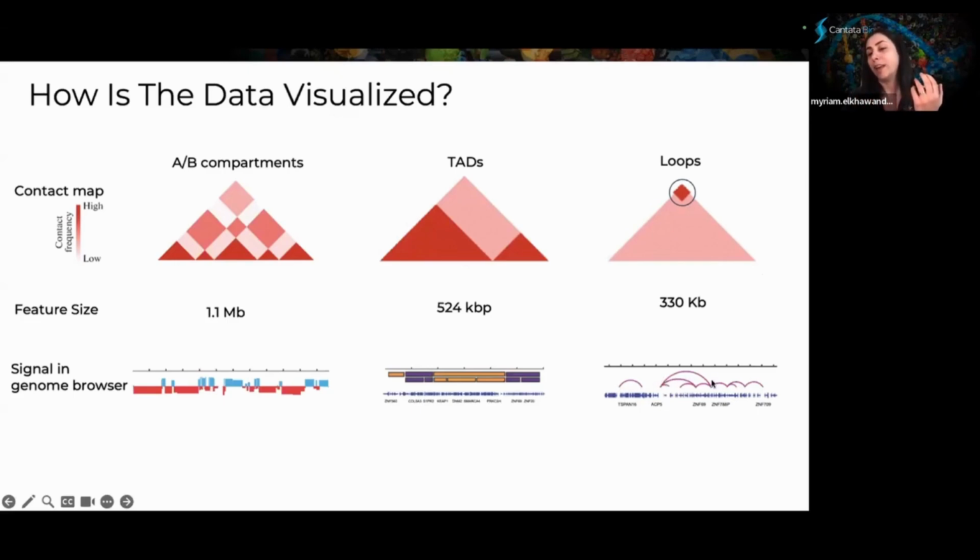So what you're seeing is these arcs. And what that arc is describing is that, again, this region and this region are interacting with each other. And you're seeing multiple arcs depicting or cataloging all the interactions that are happening between the different regions in the genome. And usually at that level, the interaction is really between a regulatory element, such as an enhancer, with a promoter site.